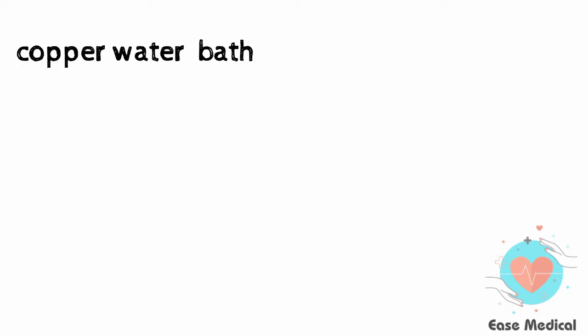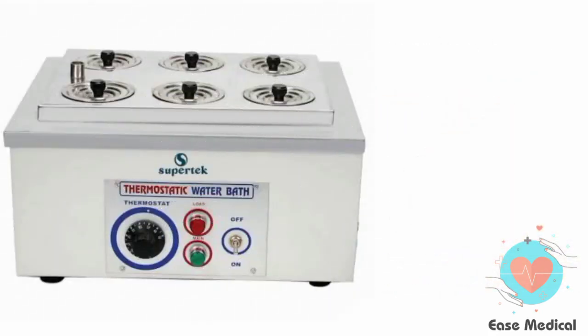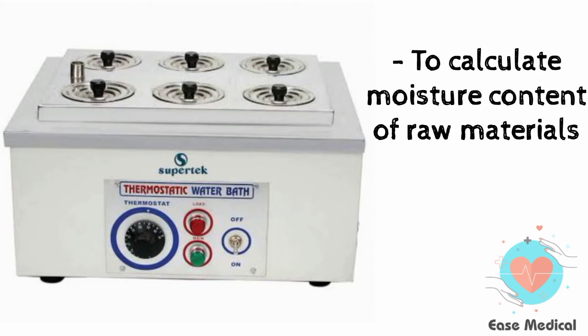Now, water baths are of two types, copper water bath and electric water bath. Water bath is used to calculate moisture content of raw materials and for sublimation.